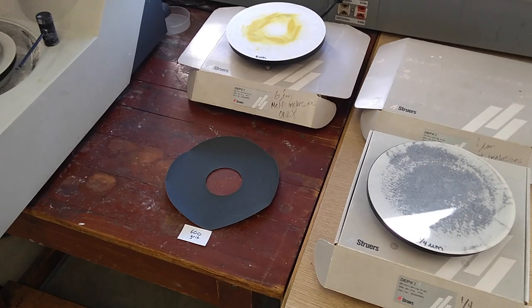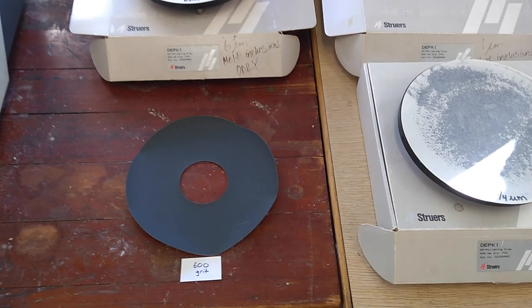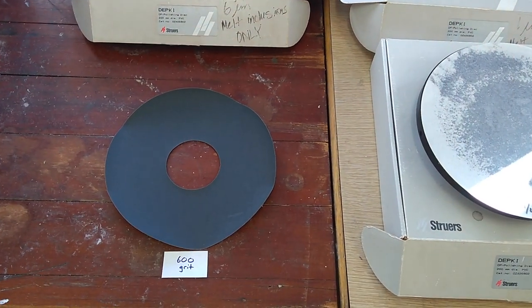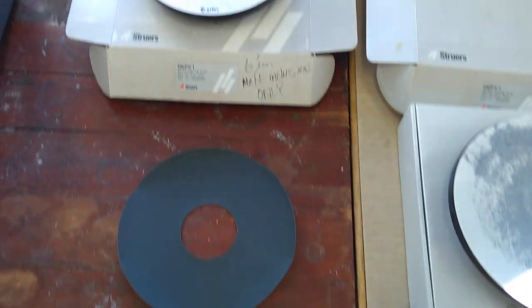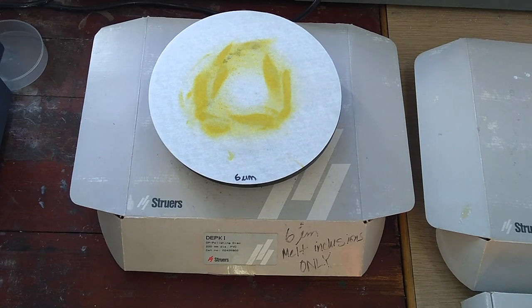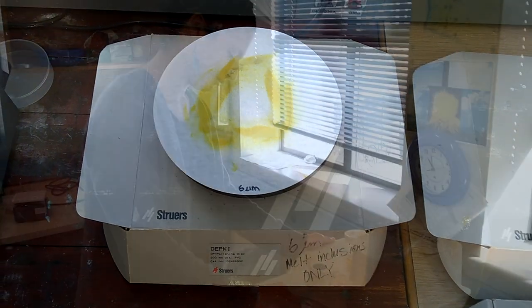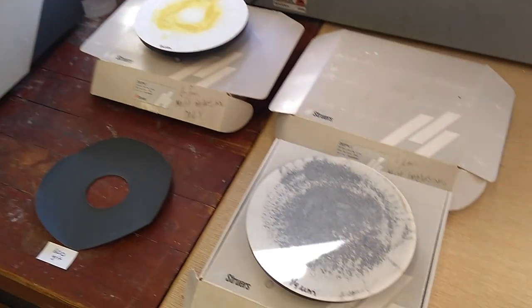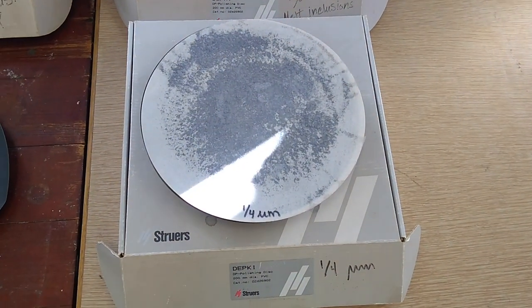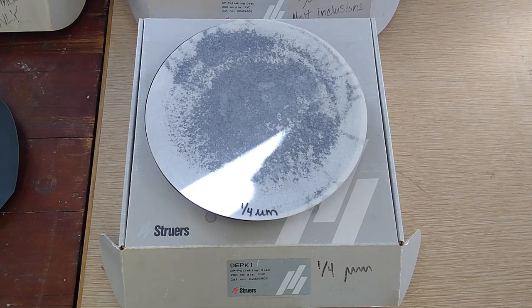First with a 600 grit sandpaper, then to 6 micron diamond paste, and last step to a very fine quarter micron polish.